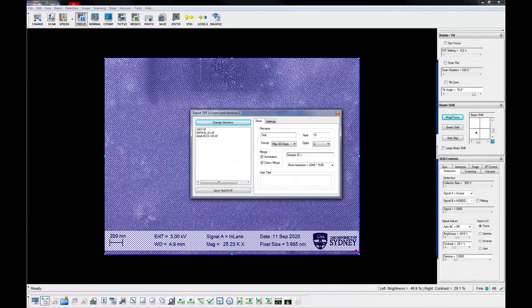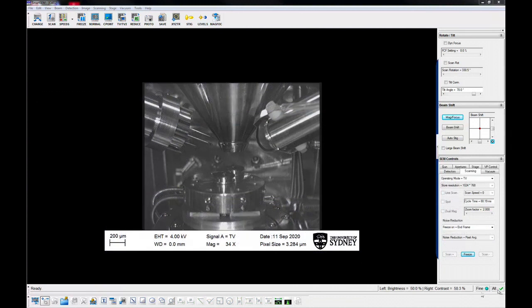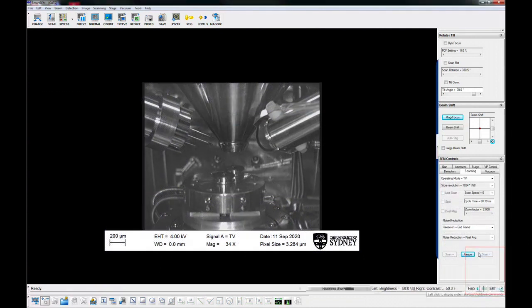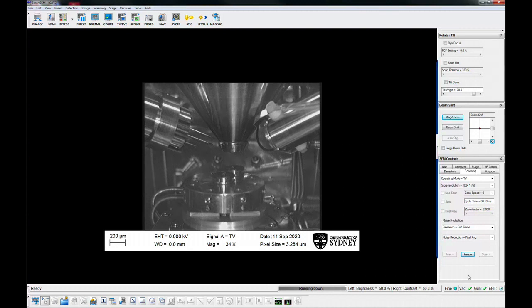At the end of your session, go to TV mode. Turn off the EHT. If performing EDS, EBSD, STEM or backscatter, then retract these devices.